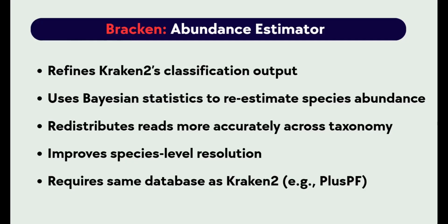Okay, so he knows you so much, and he is confident you belong to a certain type of species. So, if Kraken 2 is your old relative, Bracken is your uncle that you see on a daily basis, so he is more confident that you belong to your father's subfamily.